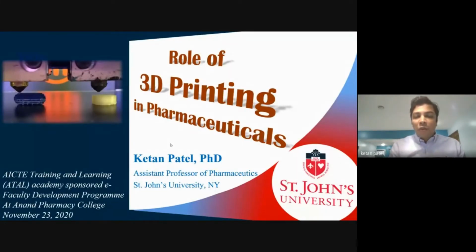So I'll be discussing different kinds of 3D printing, the 3D printers that we use here, and then the advantages and disadvantages of each of the printers, as well as how we can use them. We have some video as well. Dr. Thakkar requested us to shoot a video demonstrating FDM 3D printing. So we made almost a 15-20 minute video that I will share at the end of this presentation. That will be like a live demo. We printed a tablet today itself.